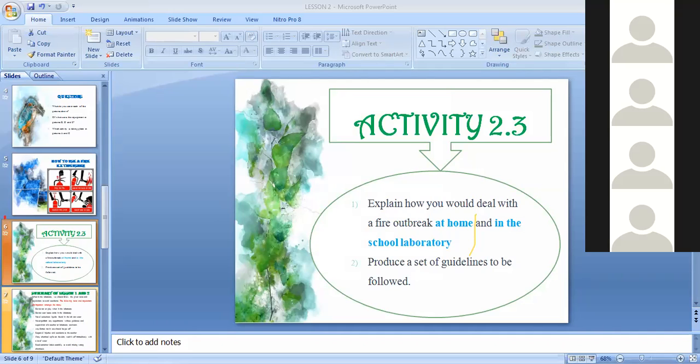I was going to say that very answer. Okay. Joel? Water. You can use water if the fire is not so big, okay?